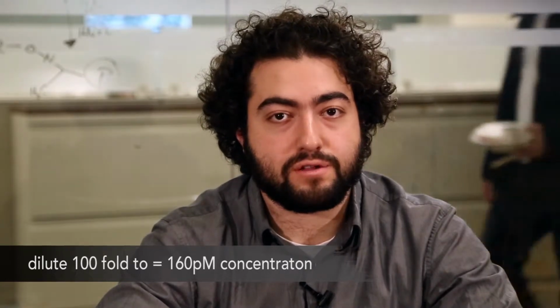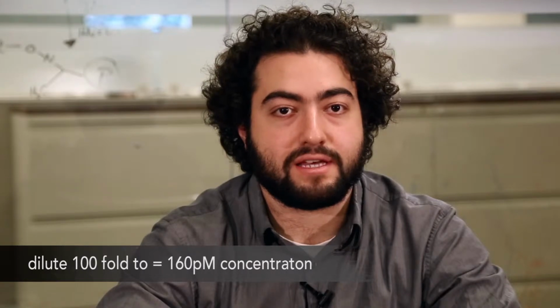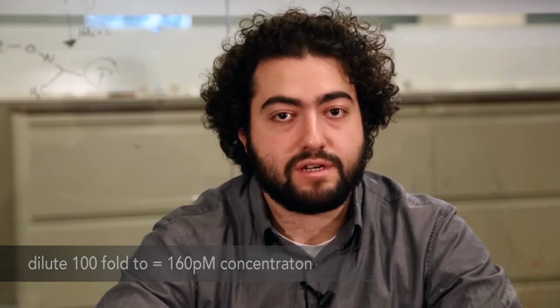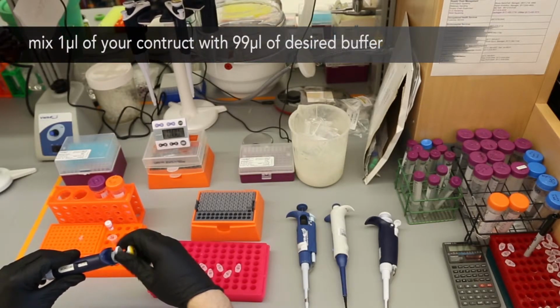Note, if you used oligonucleotides at lower concentrations, your construct may already be less concentrated than 16 nanomolar. If you use different volumes in creating your construct, you must calculate the final concentration of your sample. In an Eppendorf protein low-bind tube, mix 1 microliter of your construct with 99 microliters of the buffer in which you wish to do the experiment.